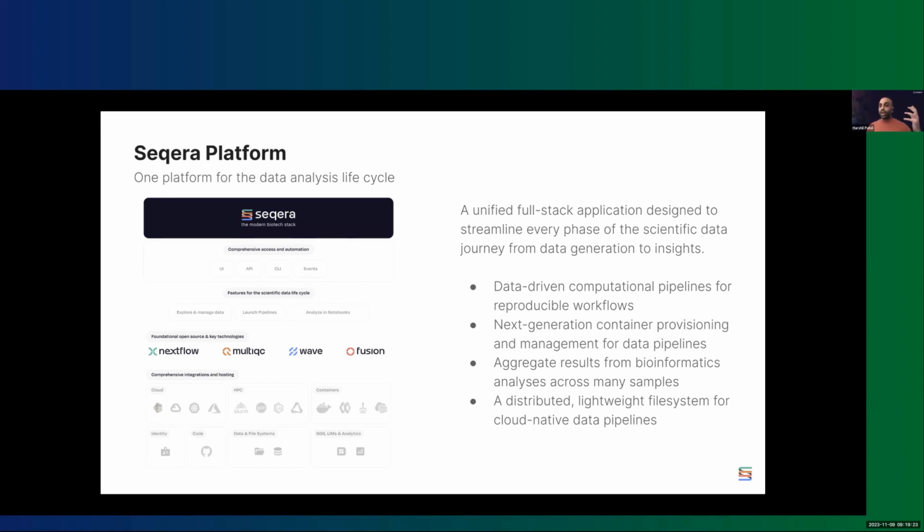So with blob storage, what you have to do is copy data from one bucket into the virtual machine where you're running your Nextflow task for a given tool, whether it's BWA or FastQC, process that data, and then publish the data out into, say, another bucket location. That can be quite wasteful and it's fragile because you're at the mercy of the cloud APIs to copy tons of data around, which can be quite huge for genomics pipelines, especially. And you start thinking about protein folding pipelines or image analysis where it's even bigger. This causes bottlenecks and issues where it physically takes ages just to copy the data into the task.